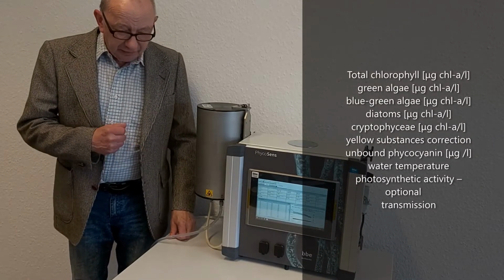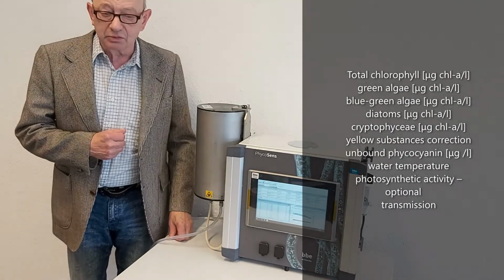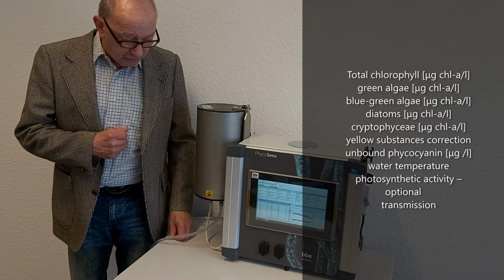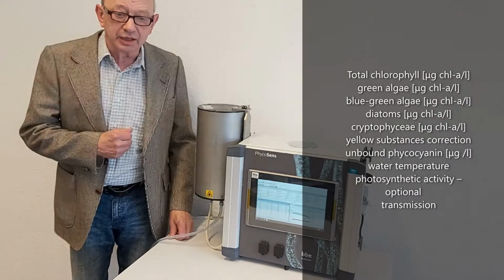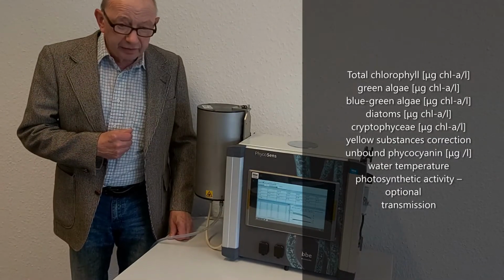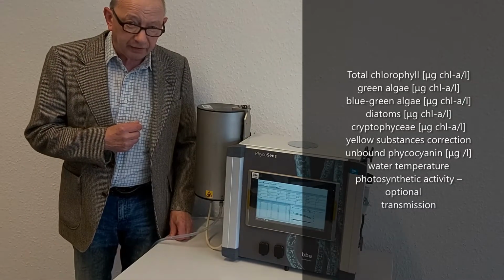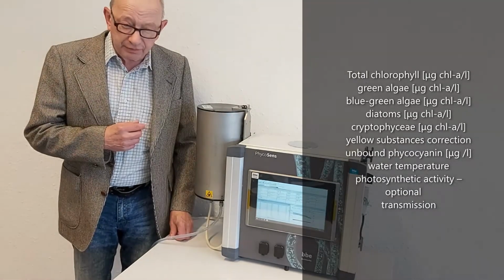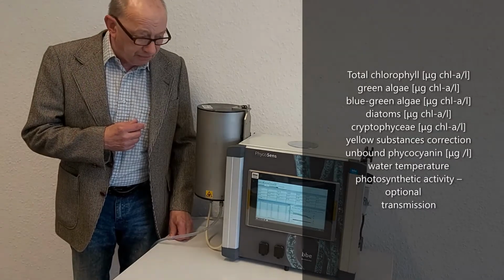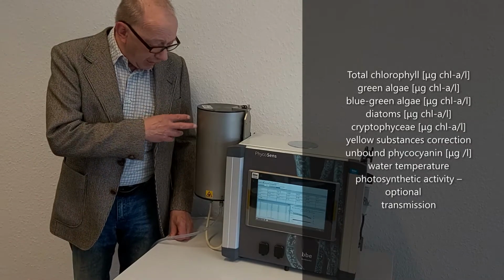What you see here is our PhycoSens, one of our new instruments from the series of Phyco instruments that we use for the determination of cyanobacteria and microalgae. And additionally, we can determine the content of the Phycocyanin, which is a proxy for probably existing biotoxin released from the cyanobacteria.